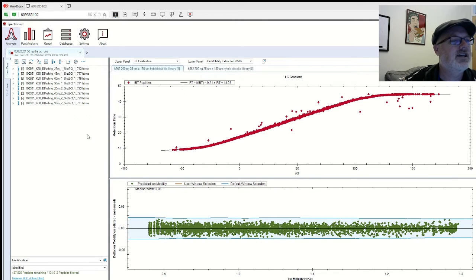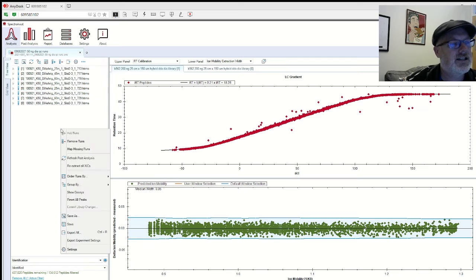If we sort by acquisition date, you can see I've randomized these. I do 25, 45, 60, 90. I didn't actually randomize them, so it looks like I did 25, 45, 60, 90, 25, 45, 60, 90. One of the things we do on the timsTOF is it assigns a number. So you can go by this number, and that'll also tell you the order. So 7, 13, 17, 19, 21, 23, 27, 29, 31. Orbitrap data doesn't do this, unfortunately. That's pretty cool. I actually forgot we ran them like this. I think Gabriella ran it. She did a great job.